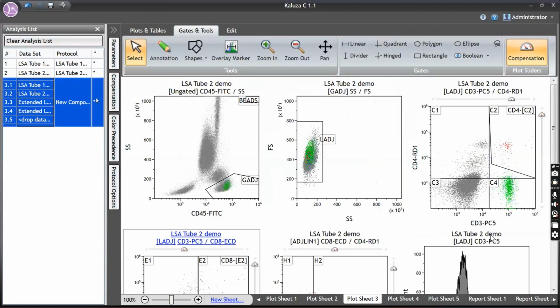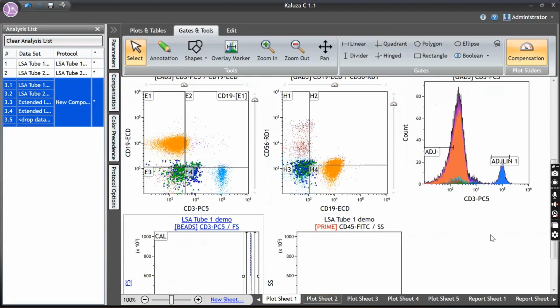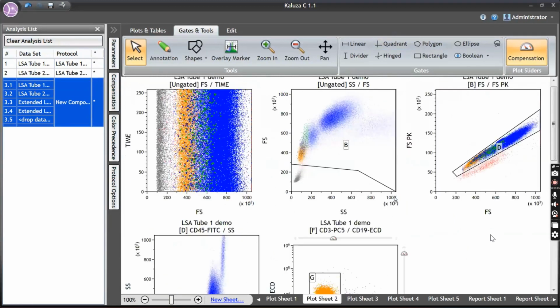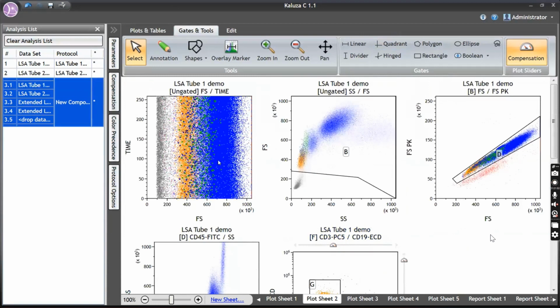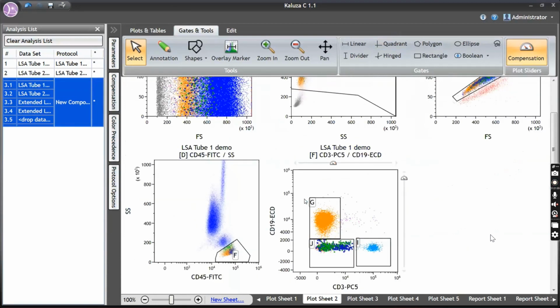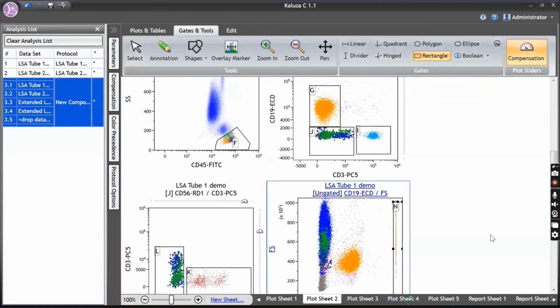Okay. Now this is about the lymphocyte subset analysis, and now these are some of the cases where you can find some immunodeficiency. Okay. Now you see this case. CD3 is very low. Okay, this one I've already gated. So time plot, then viable gate, singlet gate, and you find this case, I've gated the lymphocytes, these are the monocytes, and when I plotted the lymphocyte across CD19 and CD3, you find CD19 is fairly normal, but the CD3 count is less. You want to know how it is the absolute count, so let me get the beads.